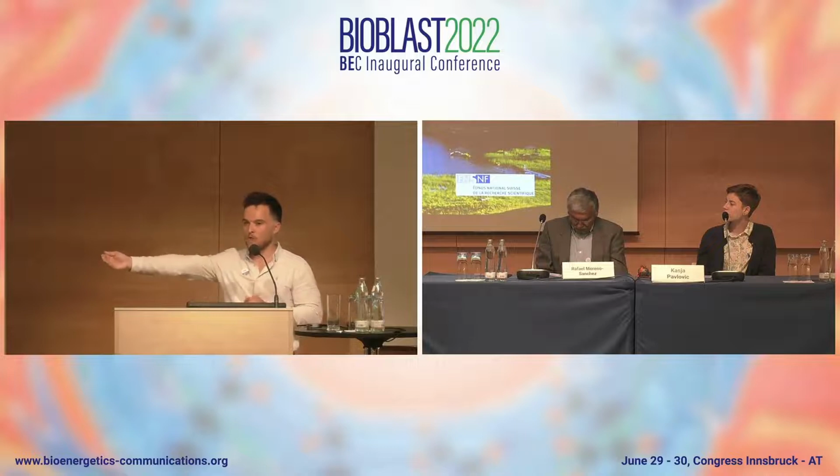Maybe we might like to say permeabilized fibers retain their structure, contacts between mitochondria and other organelles. Really, for respirometry, is this true? And actually, I think hopefully we'll have a paper that shows that they are all linked in a certain way, but then we must take into consideration when is it the most appropriate model to use, whether it's the permeabilized fiber, or isolated mitochondria, or even tissue homogenate. But in the permeabilized fiber, you also wash out the myoglobin, right, with your permeabilization steps. So you kind of get rid of that oxygen binding capacity.